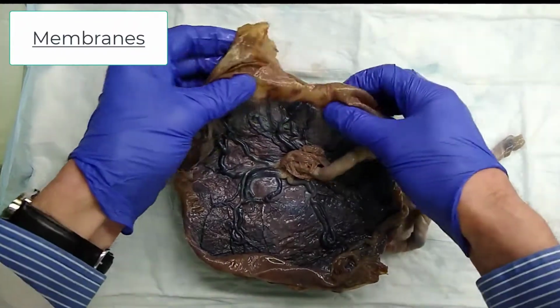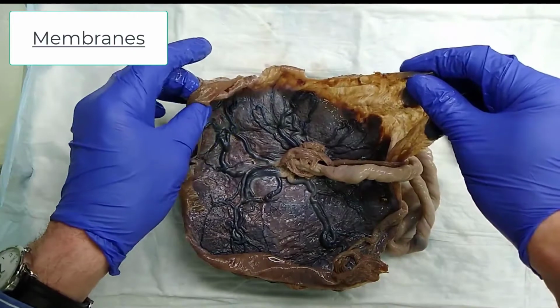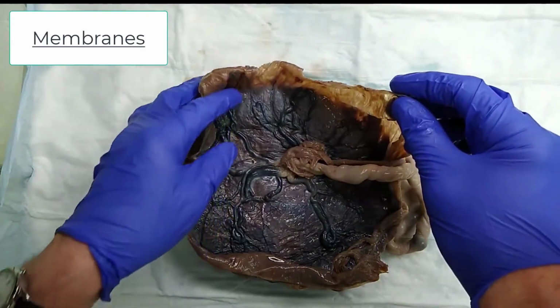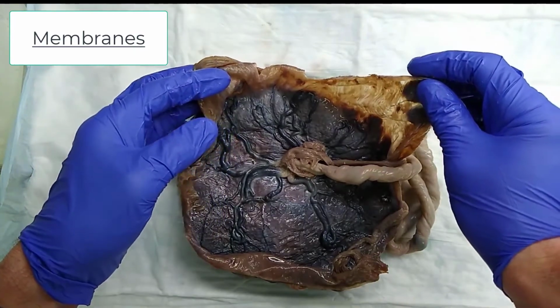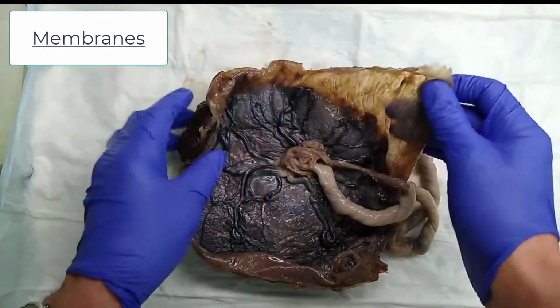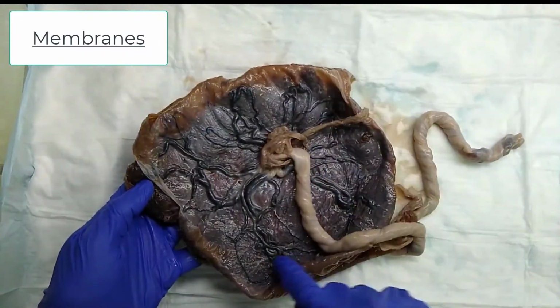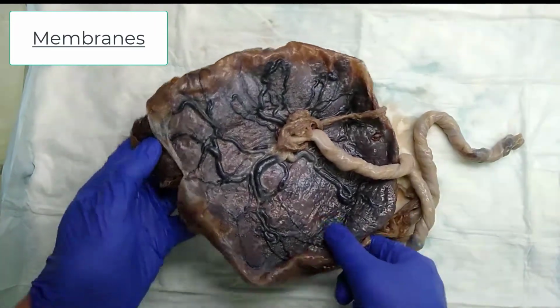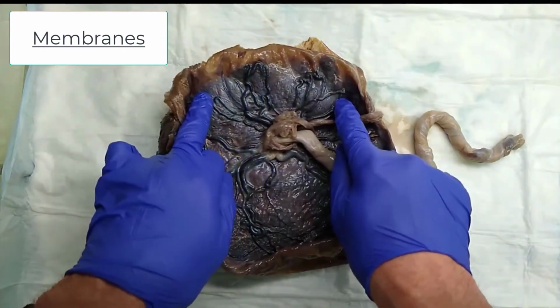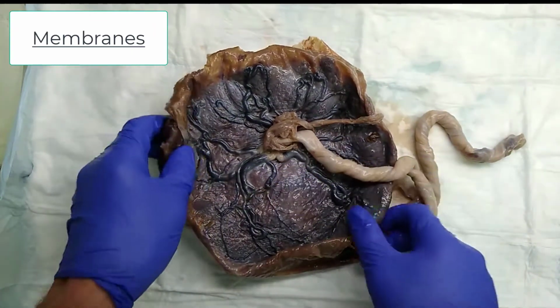Okay, now we look at the membranes. The membranes are the extension of the chorion and amnion that envelop the amniotic sac where the baby is contained. And the membranes normally attach circumferentially around the edge of the disc, but the membranes can also insert away from the margin, which is called either circummarginate or circumvallate insertion.